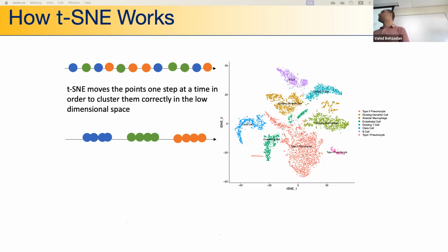That's actually a beautiful question, and a beautiful point. It's rare to find an individual unique cell that is important because we are explicitly filtering them out. Isn't that right? In the outlier detection, in the thresholding, we are trying to get rid of things that aren't similar to other things in terms of the number of genes and number of count reads, which could reflect errors in the data collection and data processing.